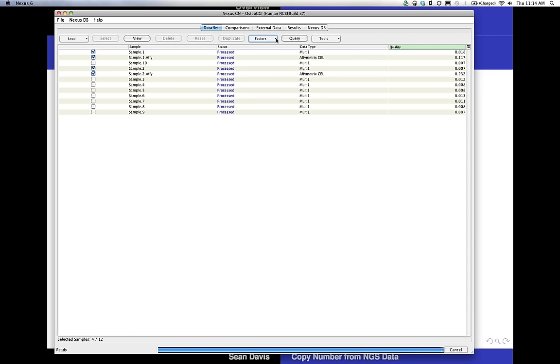And if you had the samples annotated using that kind of information, you might be able to see that, just as a hypothesis you could test, samples that show an inactivating single nucleotide variation or insertion deletion event don't show homozygous deletion. And those that show homozygous deletion, of course, we wouldn't actually have sequencing data for. The data just wouldn't exist. So you can begin to draw those kinds of correlations.